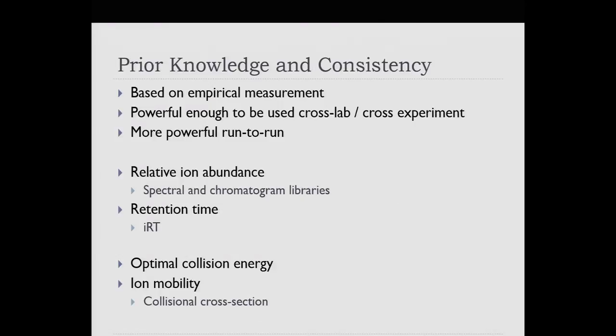So before we do, I just want to go over quickly what I think those of us who've been practicing targeted proteomics for the last 7-8 years feel pretty strongly about: that whole refinement cycle I was talking about, and prior knowledge of your peptides and your proteins, allows you to measure them much more accurately.